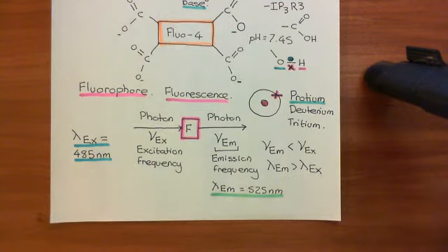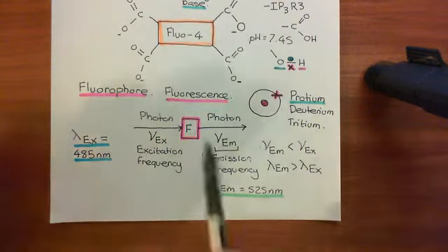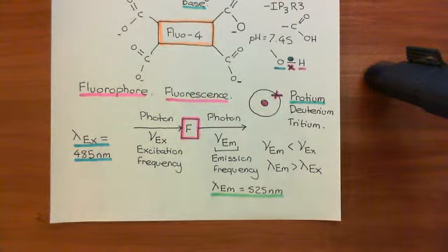That is the property of fluorescence, that you can shine one color of electromagnetic radiation, and of course it doesn't have to be in the visible spectrum. We like it when it's in the visible spectrum because then we have a decent understanding of it. It can be in other portions of the electromagnetic spectrum. You shine a photon of one frequency on, get a photon of a different frequency off. That is the principle of fluorescence.